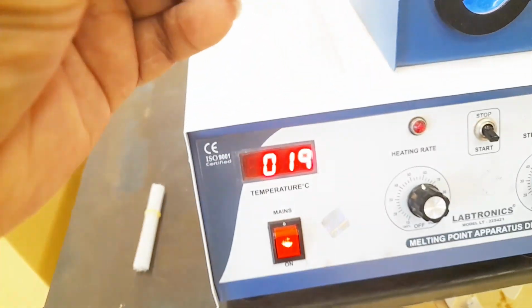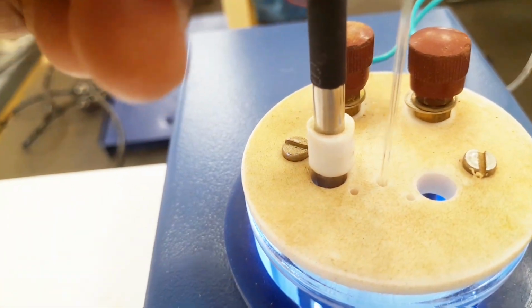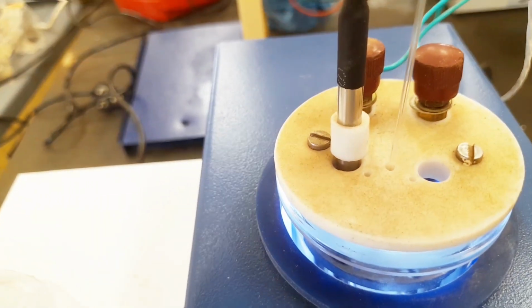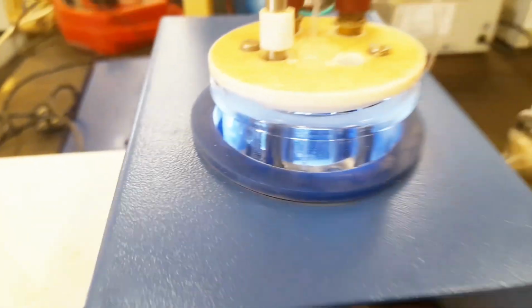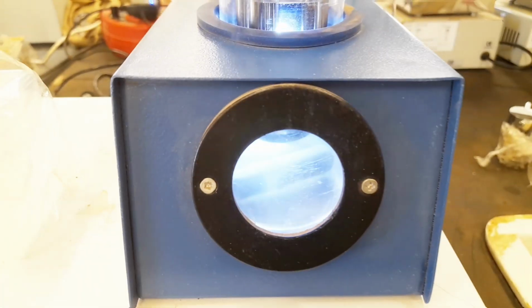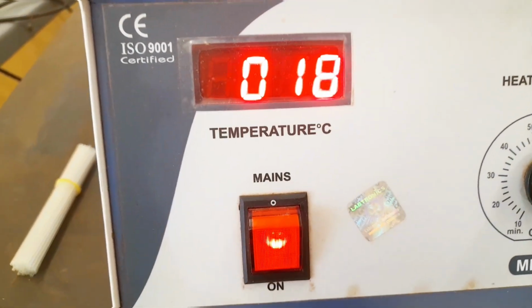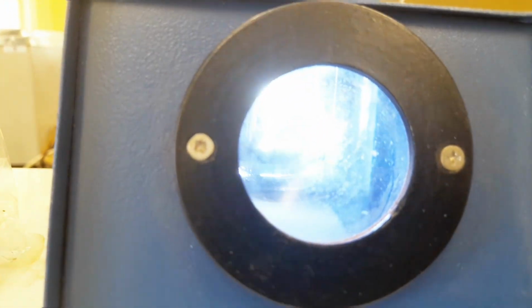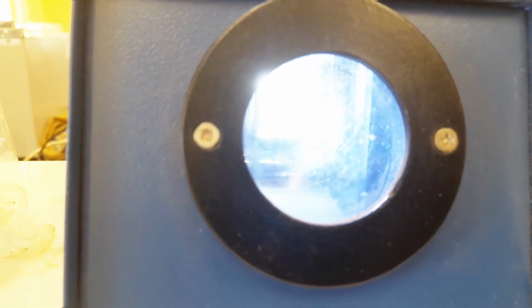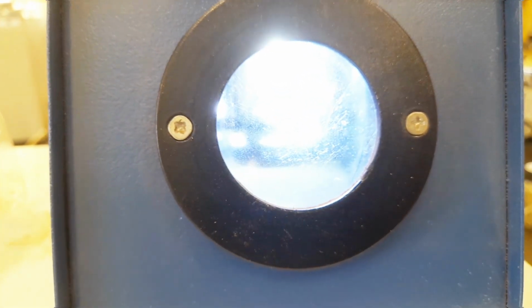Then after this we have to insert this capillary tube into the small holes that are available here. We have to insert slowly into the chamber containing the oil. So now you can see when we start the process, when the temperature increases, it will be visible on the board as the temperature is increasing, and we can see from this there is a light source. We can see from this exactly the point when the solid sample converts into liquid. That point we have to note down. That is the melting point of the pure compound.